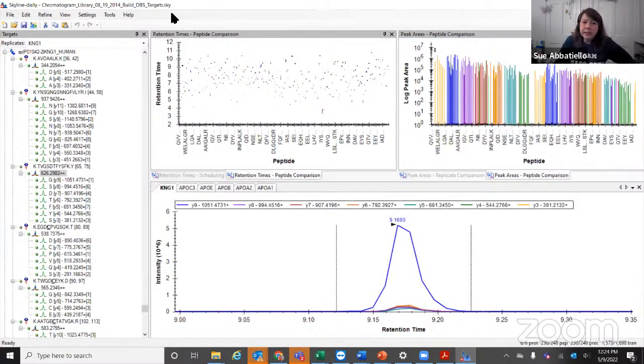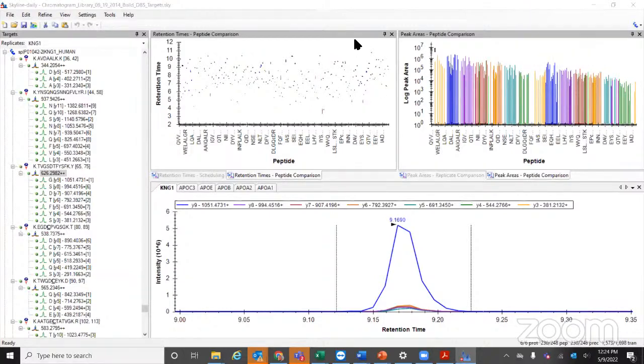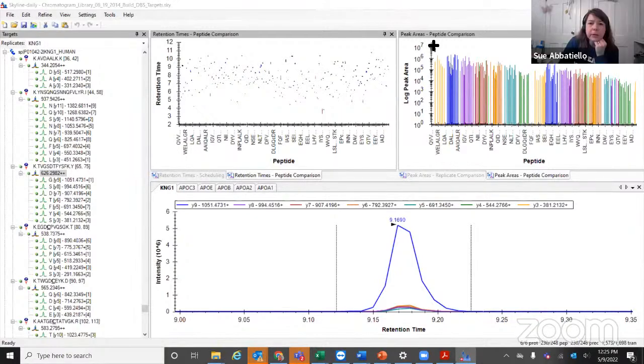All right. Does anyone have questions on things they want to get from this data set but haven't figured out yet, or similar things they want to get from their own data sets that we can use this for, and we can get a couple specific questions hammered out? Got lots of questions in the chat, but only one of them is maybe regarding this data set. There's a question asking, what exactly is a scheduling window and what do you use it for? Oh, okay, that one I can show.